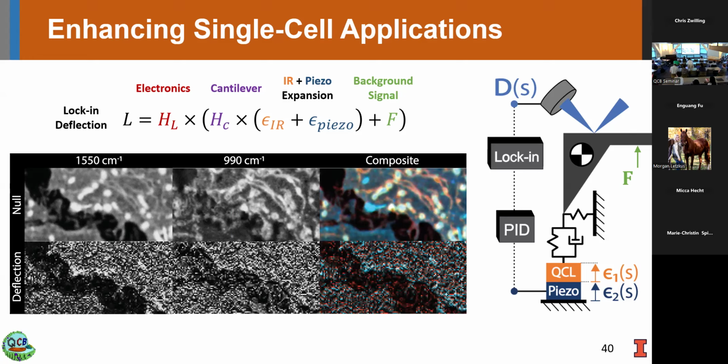So when you say chemical, can you help me interpret what I'm seeing in either the separate or composite? What does blue versus red tell me here? That's a good point. The black is essentially epoxy. The blue, light blue, even green, would be protein. Blue is basically the amide 1 band of protein. The green channel was set to amide 2, which is just another protein band, because at the time we didn't really have many other peaks to look at.